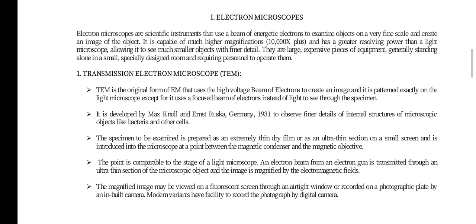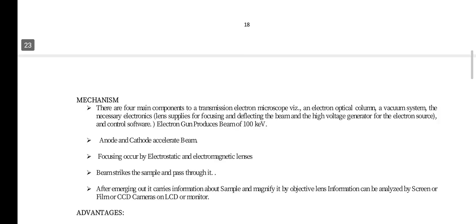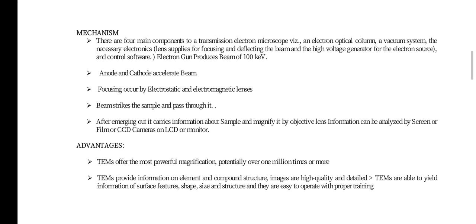The magnified image may be viewed on a fluorescent screen through an airtight window or recorded on a photographic plate by an inbuilt camera. Modern variants have facility to record the photograph by digital camera. And the mechanism of transmission electron microscope.